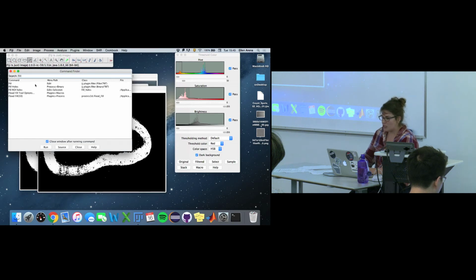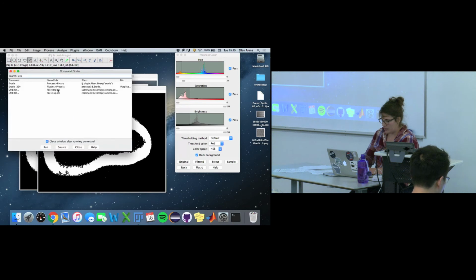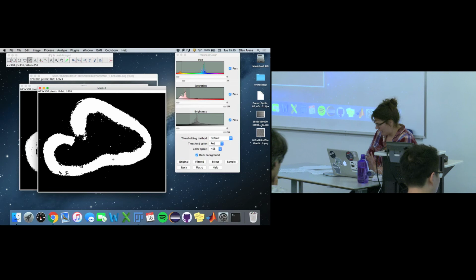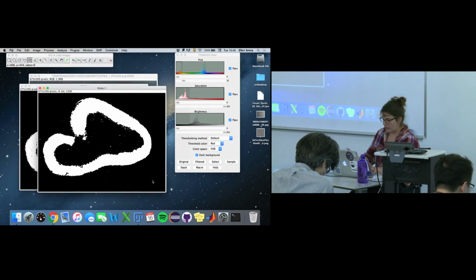So now I'm just going to use a combination of erode and dilate, just to try and grab some of those. So I'm going to erode now. I dilated and eroded. And then I'm just going to fill holes one more time. I'd say that's pretty good. Not bad. I'm kind of happy with that one. That's fine. So now we've got our digestive tube all ready to go.